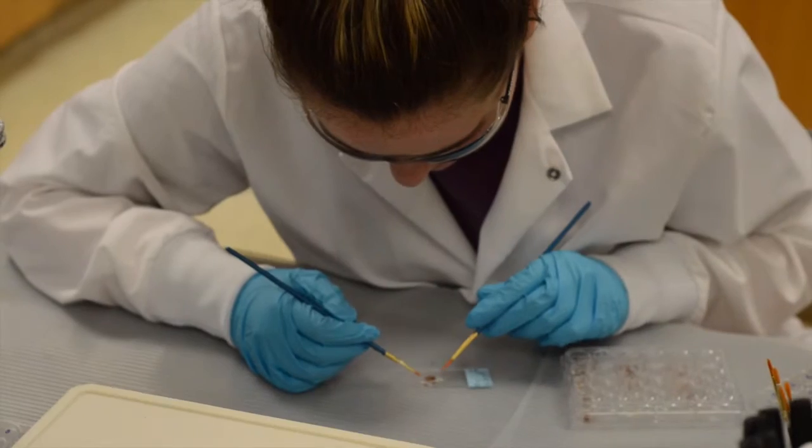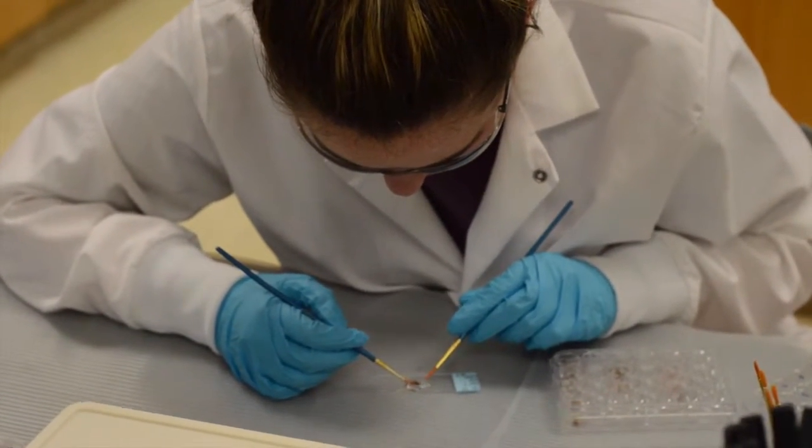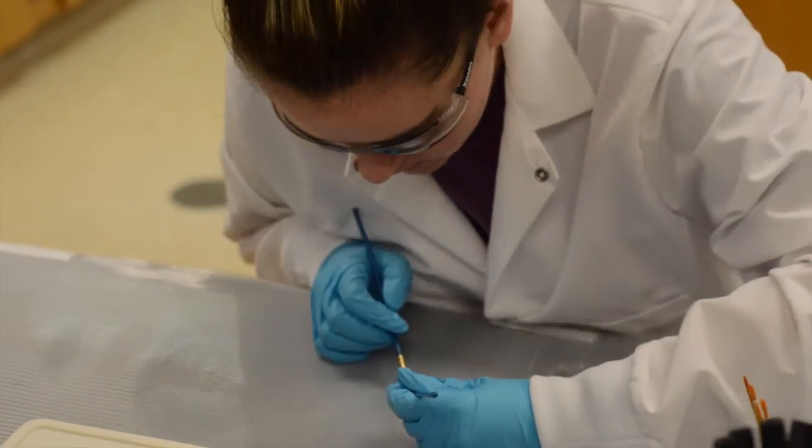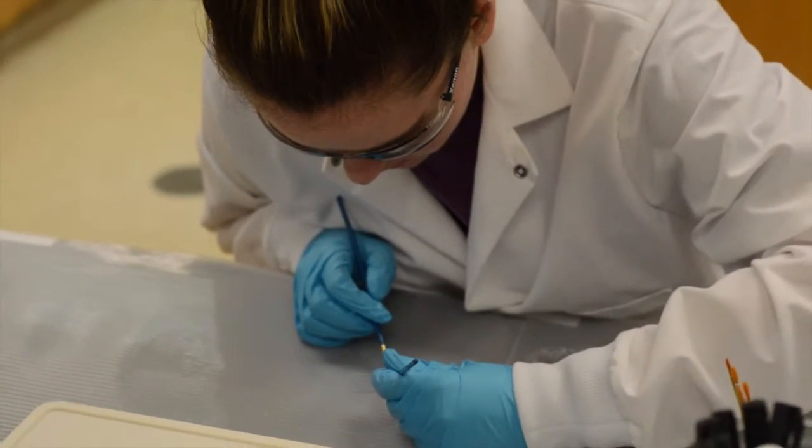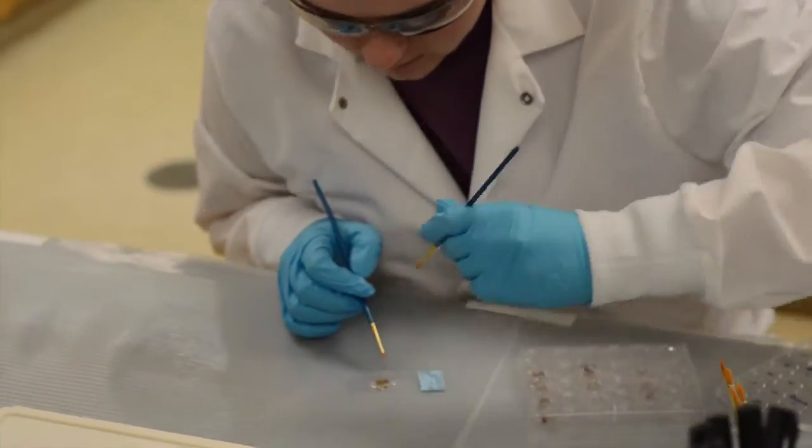Use a paintbrush to aid in this process. Once the slide is ready, remove the water, add a drop of permount, and cover the microscope slide with a cover slip. Store the slide in a slide box for further analysis.